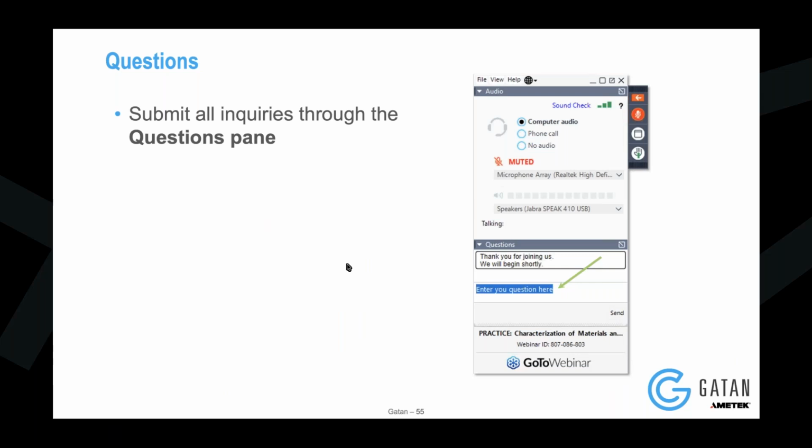Great, thanks. One question that we got on the DPC experiments is whether you see any effect of the scan pattern that you use on the actual vector directions of the DPC. I guess it's probably the DPC I showed with the segmented detector, but at that point we were only rotating the scan pattern itself, and it was much lower magnification DPC in that case.